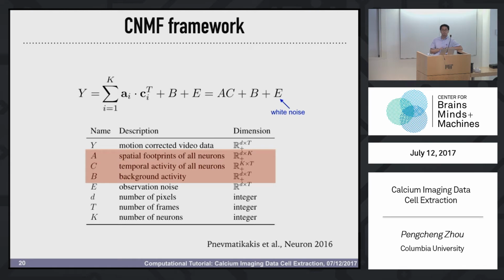Yeah, this is a very good question. The question is: if the spatial temporal activity couldn't be composed into a rank 1 matrix, that means the neuron shape is not constant. In some frames, the dendrite will have a large fluorescence intensity, while in other frames it will not. Is that your question? I think in this case, rank 1 is clearly not good enough.